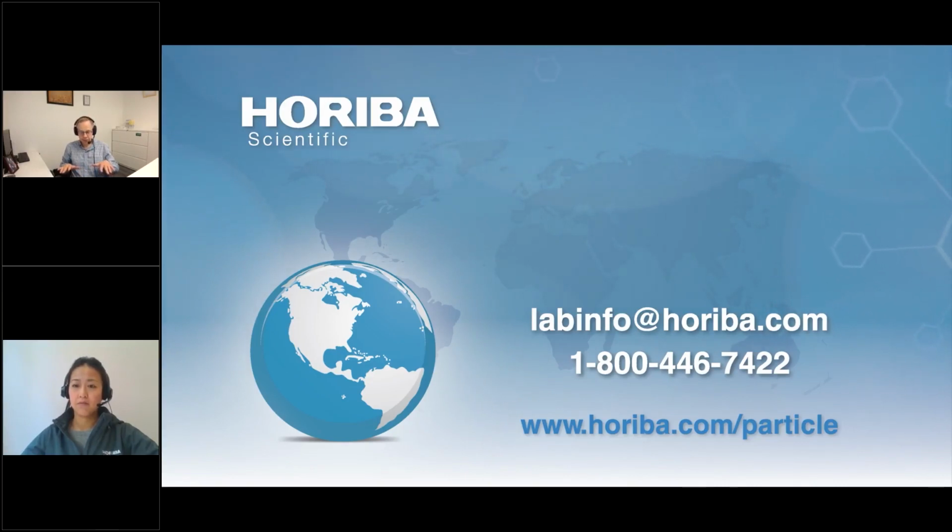But if you have nucleation growth, when the nuclei first appear, you should see a jump in your scatter intensity. And then you'll start measuring particle sizes from even the smallest size nuclei. There's some limits. You do need to apply some sort of a model to track your process until your size range gets up to, say, nanoparticle tracking, where you can count your nuclei. But that would probably cut in at a larger size. But DLS has been used for dynamics for a while. And again, the fact it reaches those very small sizes is quite handy.